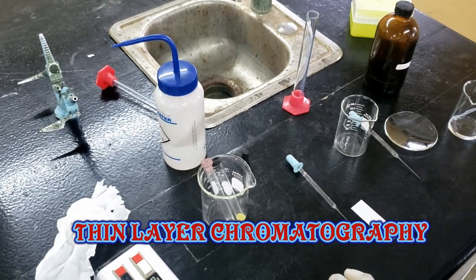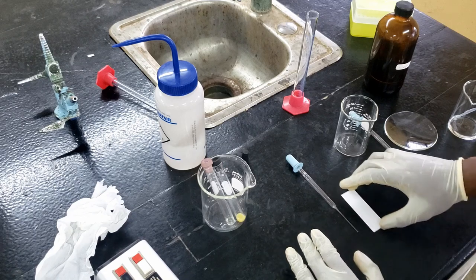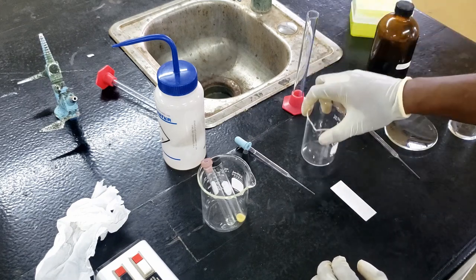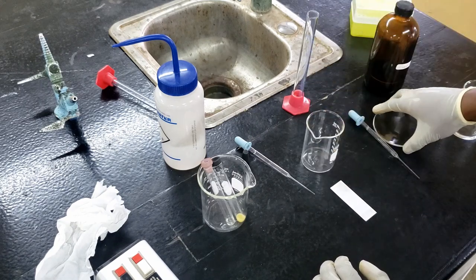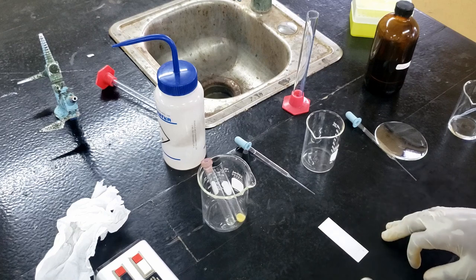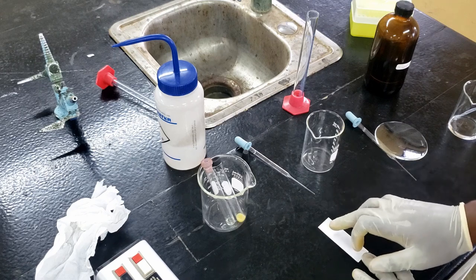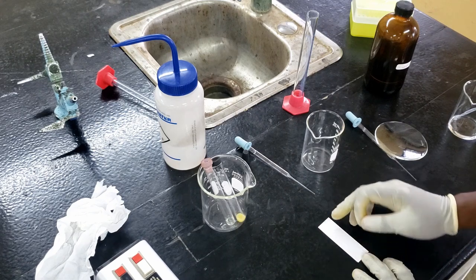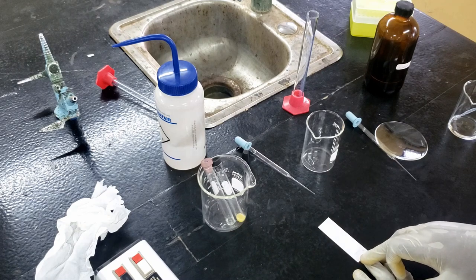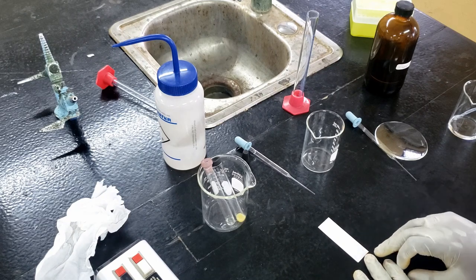Now that we've gotten our two products, the o and the p-bromonitrobenzene, we're now ready to create our TLC plates. So first I'll create a chromatogram. All you'll need is a beaker and a cover watch glass. We have our TLC plate already marked. So I have a line about a centimeter above the bottom, and then we want to end about a half centimeter from the top, so I have a little mark there for me to know when to stop. I have a P for the spot where we'll put the p-bromonitrobenzene, and an O for where I'll put the o-bromonitrobenzene.